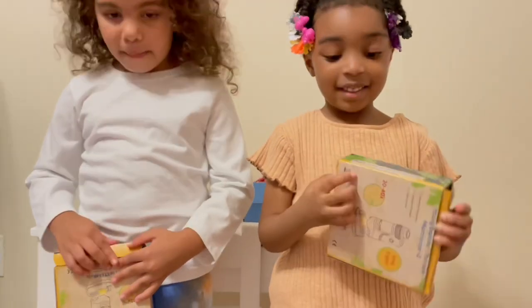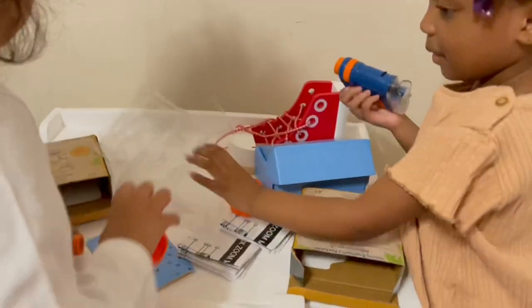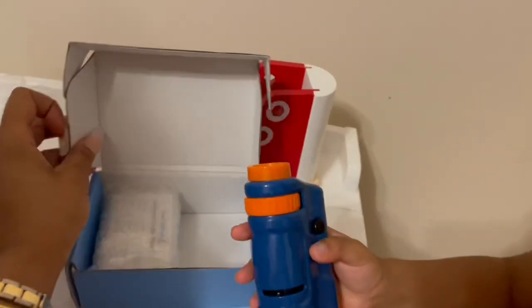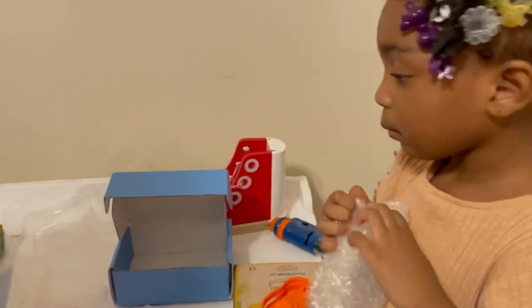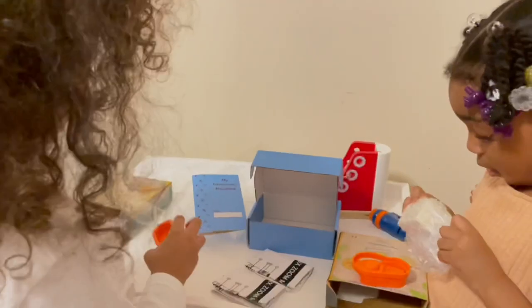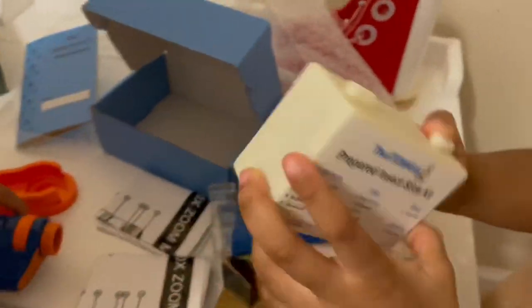Alright. And it looks like they sent us a kit over here. Let's see. I got mine open. So cool. Now it looks like it came with a kit here. Open up. Looks like some slides. So that you guys can check out. I think it looks like some insects. Insects? Okay. So it comes with a prepared insect slide kit.